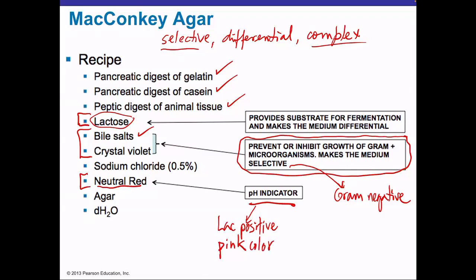Not only will the colonies show this pink color, the medium also will be turned pink as a result of the acid that is being produced.